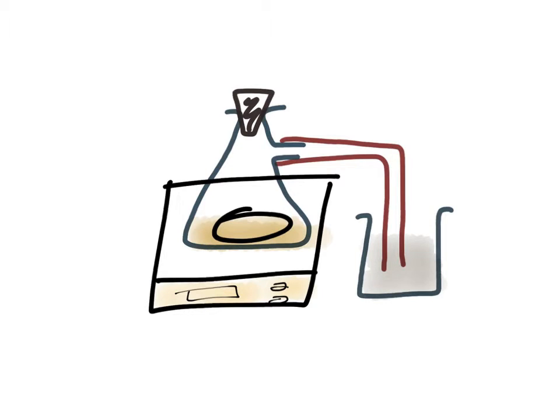Okay, Liv, this is the experiment that we did for working out the mass changes during the fermentation of glucose. We had a conical flask, or what's called a sidearm conical flask. It's just got this little opening on the side there. We had 10% glucose solution, 100 ml of 10% glucose solution.